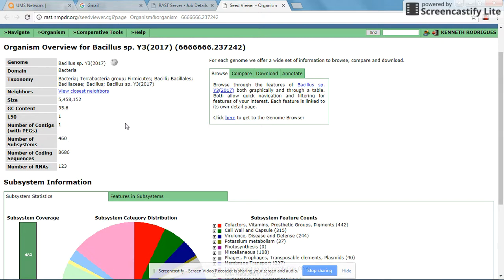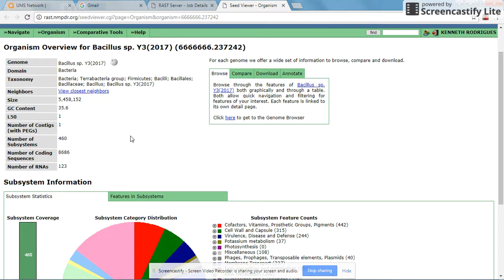Generally with bacteria, when you obtain a single contig, it means that there is no plasmid. However, when you do your wet lab, you need to ascertain whether there is a plasmid by using a plasmid lysis miniprep to determine whether your genome actually has a plasmid or not.